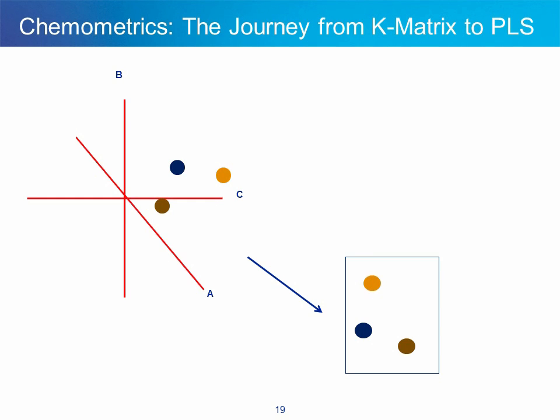In a 2-component noise-free system, the spectra will all lie on a plane. We will rotate the plane so that it lies in the plane of the screen. We have changed the orientation so that it is easy for us to see the data transformation we are about to do. The relationship between the spectra and the axes doesn't change. The axes could have been shown in their new rotated position.